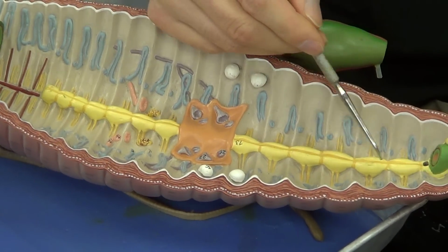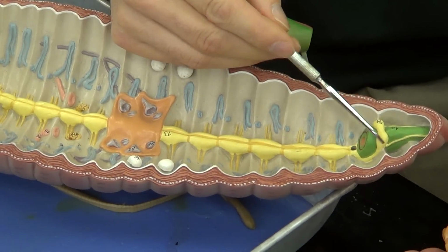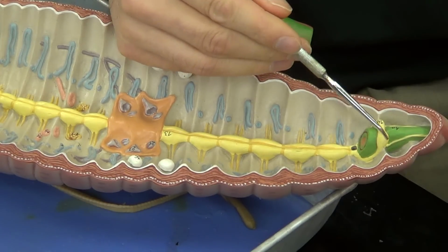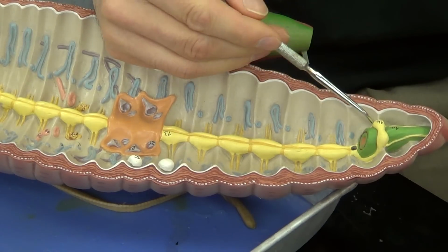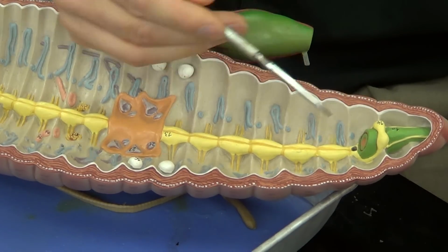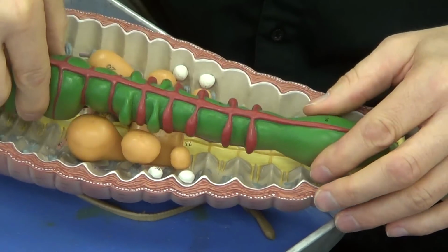Now at the most anterior aspect of the earthworm, up here, this nerve cord is going to form a large, at least with respect to the earthworm, a large focus of nerve tissue where nerve impulses actually get processed. This is called the brain right here. This is the brain. It's going to be very small in the earthworm, but if we see it, I'll point that out to you. Now let me go ahead and put this back together again.